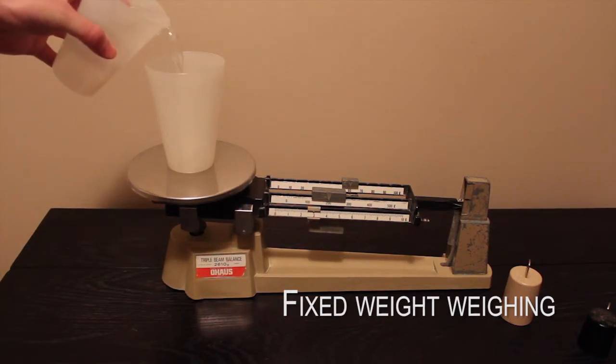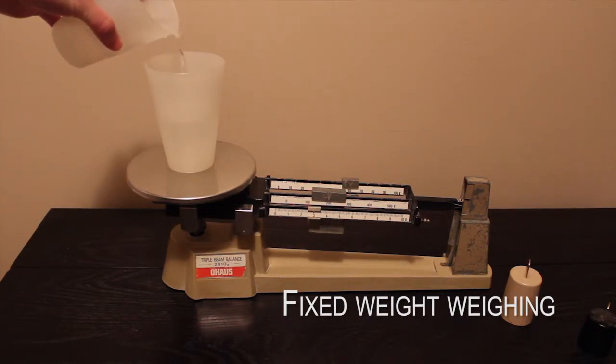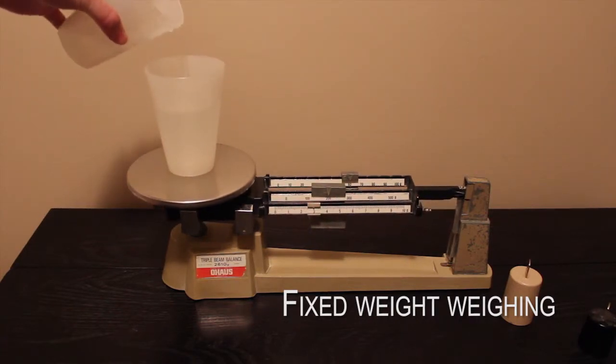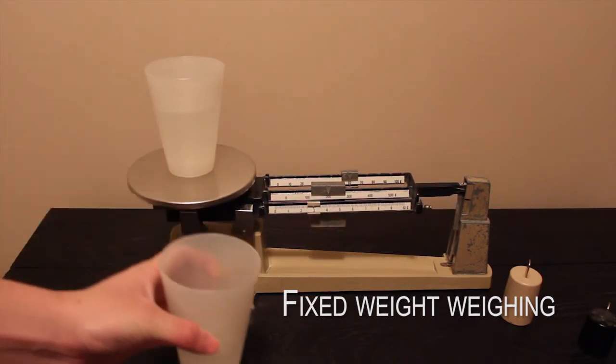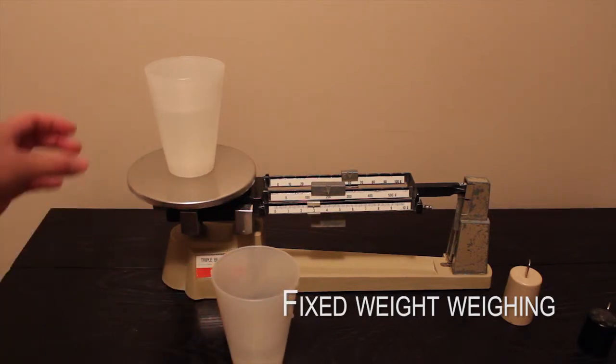This process requires accurate work in pouring in material to the container, and if too much weight is added, the balance pointer will go up beyond the middle point. Remove some material, and re-add material until the balance pointer reaches the middle.